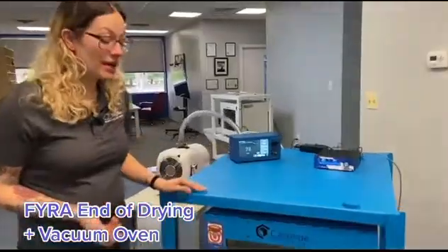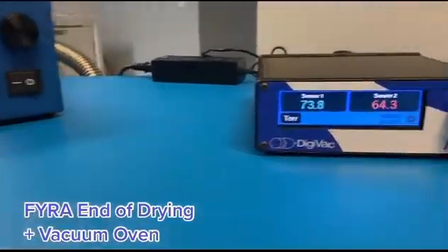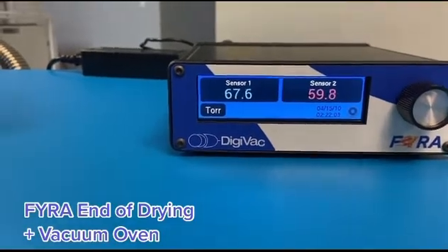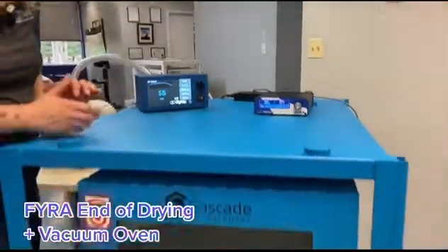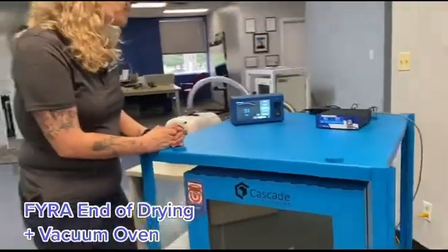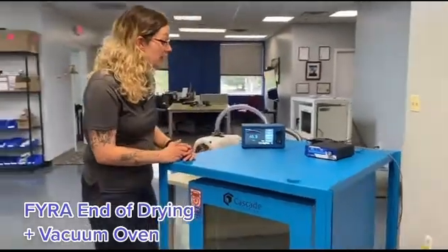We've soaked our rag in isopropyl alcohol and put it inside the oven. We've been pulling vacuum with our IDP10 for several minutes now. As you can see, we've reached nowhere near the vacuum level as we could in a clean, dry system. This is illustrated also by the pressure differential in our FIRA sensors — they're diverging a lot, so we know that the system is wet. Now we'll close the system and watch the pressure inside rise rapidly as a result of the outgassing material.